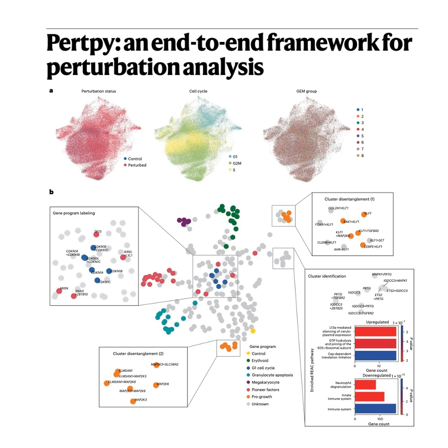Precisely. And the problem is a lot of the established analysis tools are siloed. They might be stuck in the older R ecosystem. Or maybe they were built for just one very specific kind of CRISPR screen. And they just fall over when you show them genome scale data. They just collapse. And critically, they often analyze the raw numbers in a vacuum. They don't integrate all the biological knowledge we already have, the metadata, the context about what these genes and drugs actually do. Which brings us to the solution we're discussing today, Pertpy.